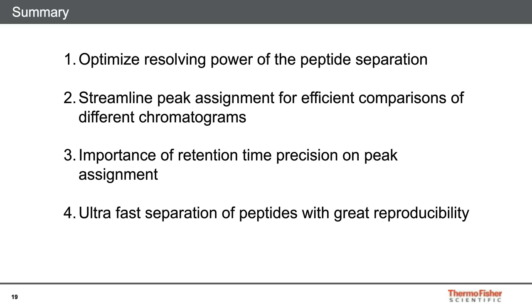We also mentioned the fast separation with the Vanquish Horizon, for which I didn't show you data, but I can tell you that the Horizon also has very good retention time reproducibility. In fact, even better than the Vanquish Flex quaternary.